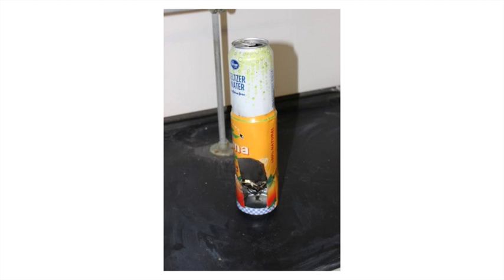Hi, my name is Coleman, and I will be going over the steps we took in completing this lab. The first step to complete this lab was building our own calorimeter. We built ours using two cans, one to hold water and the other attached underneath for the food to burn, so minimal heat would escape. We allowed space above the flame for heat to be contained.